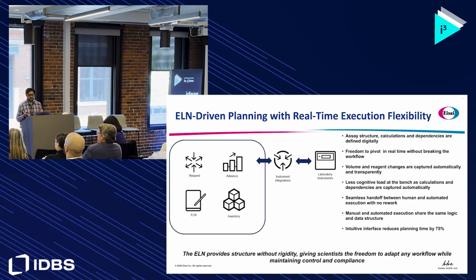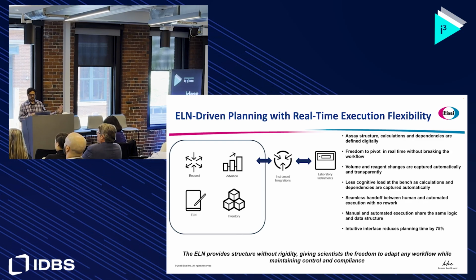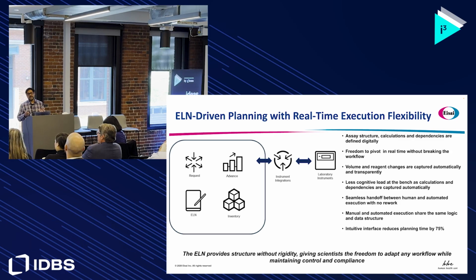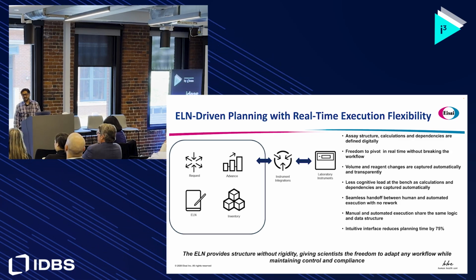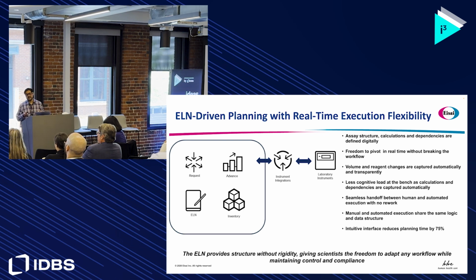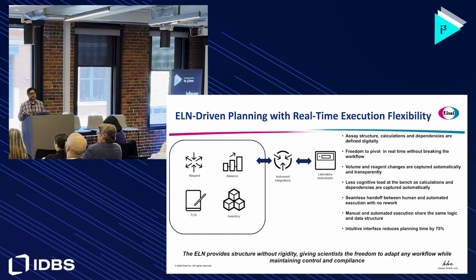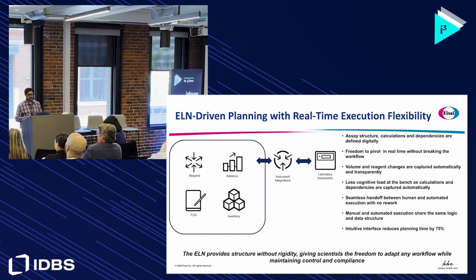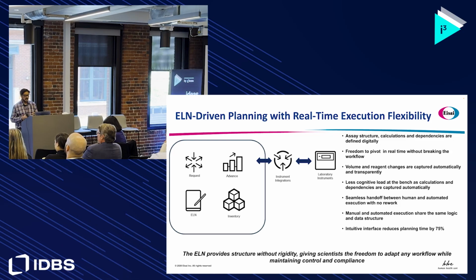So now they're just focusing on the work that they're doing. They can pivot, the template's there, and they'll work with it. And we do have automation capabilities, but you don't always want to do everything on a robot. Maybe it's just something small, and you can just do it by hand. If we have those situations, the template shouldn't dictate that. You should dictate to the template what you want to do. So it should be interchangeable, and that's what we're building now.